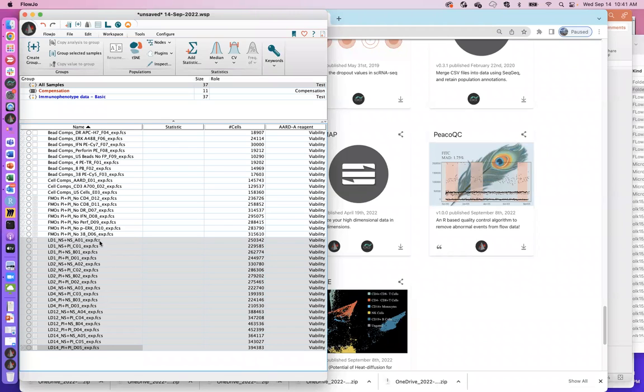And I want to annotate the data so that I can mix and match. I can sort by time point, etc. Okay, now, the easiest way to do that is to segregate the files first into a group so that you can annotate them accordingly. Okay, so I like to block highlight them like this.